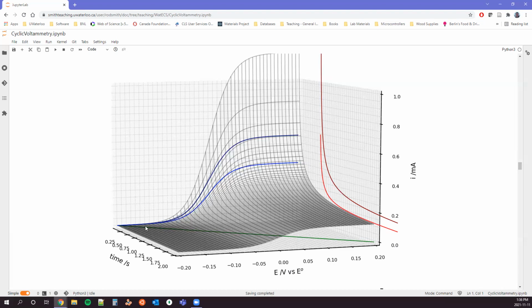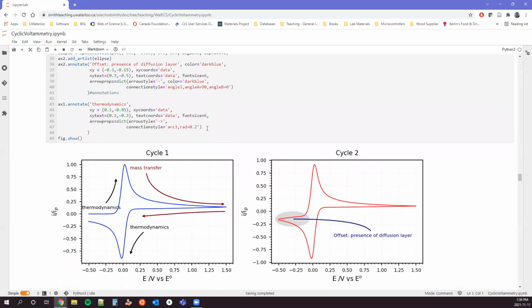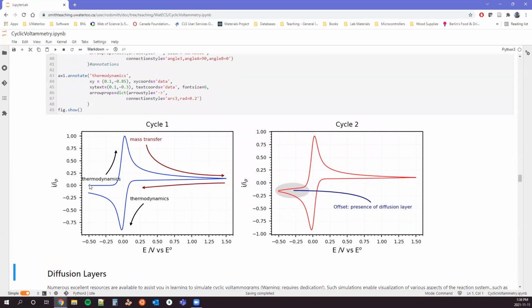Our current is going to go diagonally across here. So it has to go up, and then because time is progressing, it has to come back down, right? We're going to a large overpotential, but the diffusion layer buildup is going to change what we see. That's what we end up seeing here. We can interpret what we see in this cyclic voltammogram that we saw earlier: as we start from our cathodic overpotential, our starting point with a fully reduced system, we sweep positively and we start seeing currents. This is thermodynamics embodied in the system, right? We're coming to a region where we're disrupting our equilibrium and forcing electron flow to cause that to happen. We hit some point where it turns around and drops down.